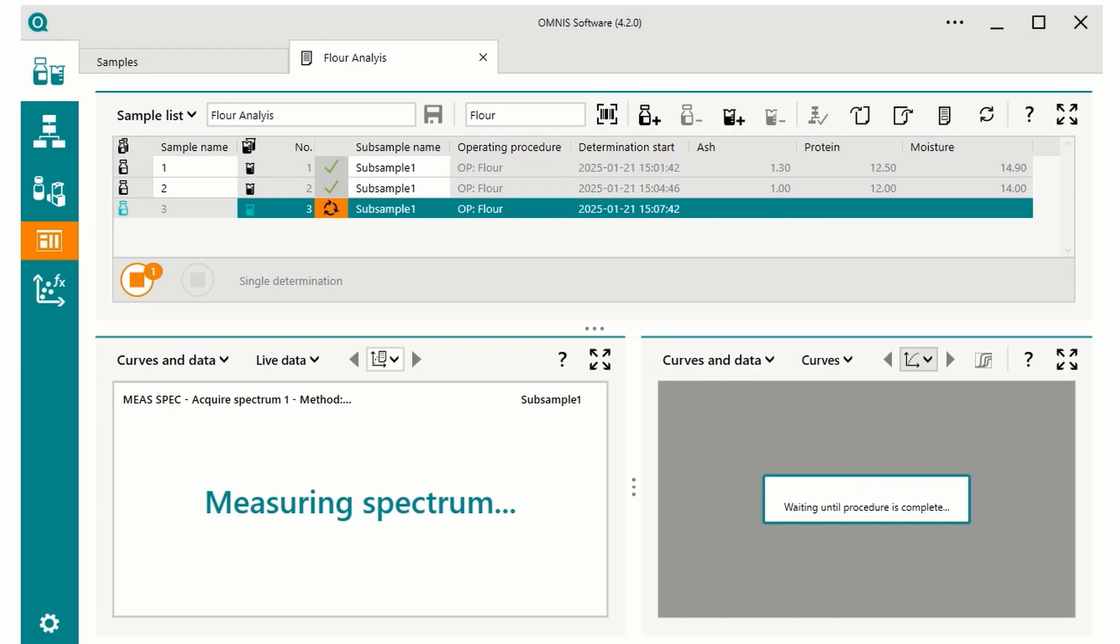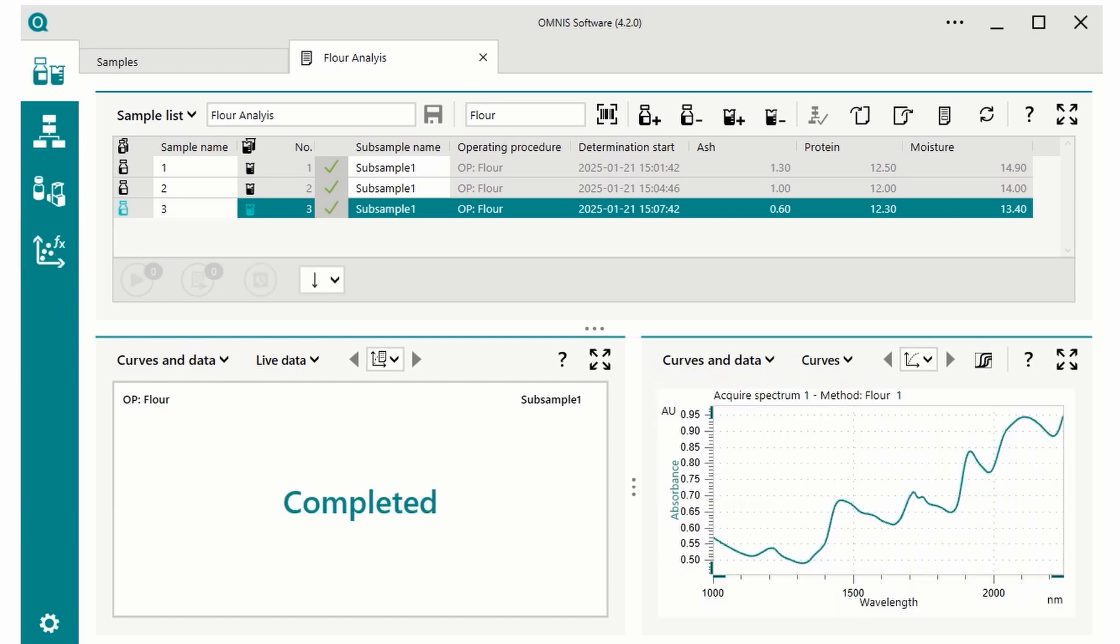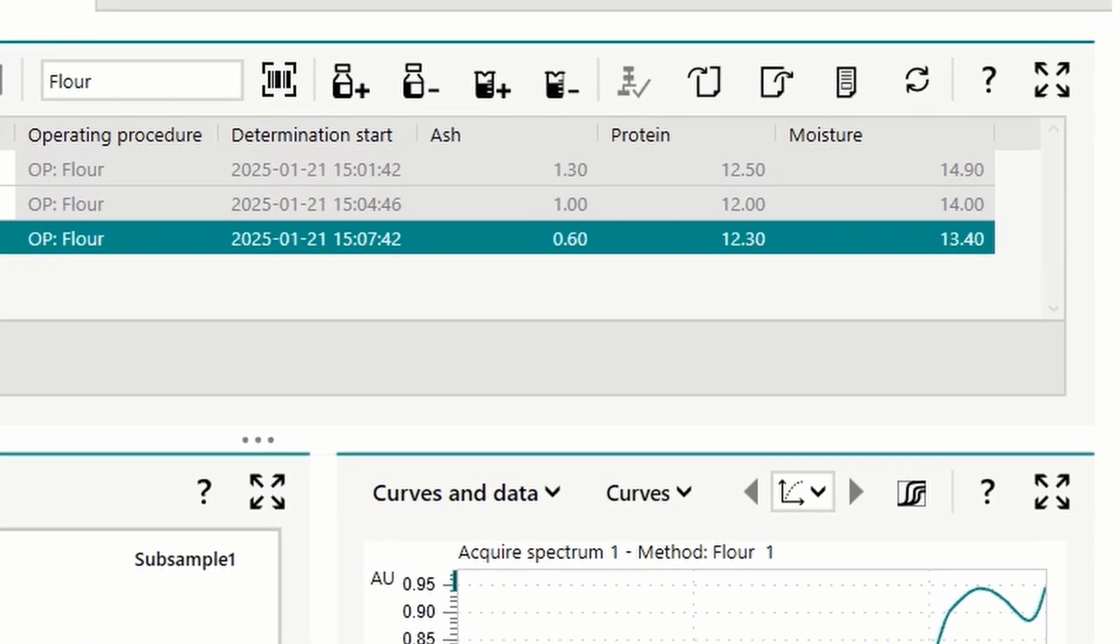After just a few seconds, you will obtain the predicted values for various parameters such as ash, protein and moisture content.